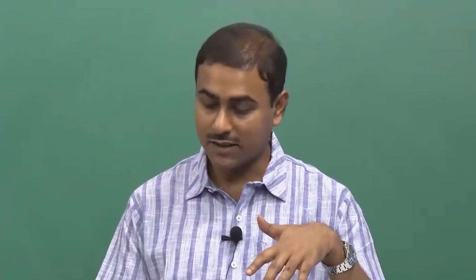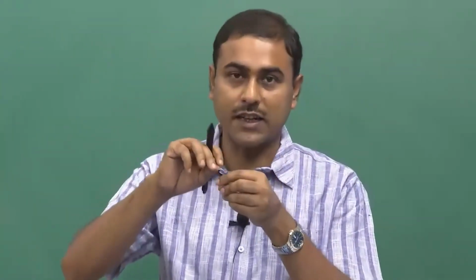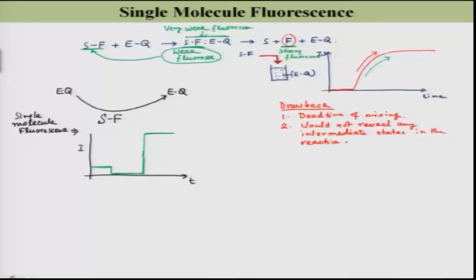Unlike this, if the reaction takes place in 1 second and you are mixing very slowly, say it took 10 seconds, then by the time you mix and shake, the reaction is over, and you will not be able to see such a rise. But in this case you will be able to see such a reaction, because all the molecules are present in the reaction mixture.